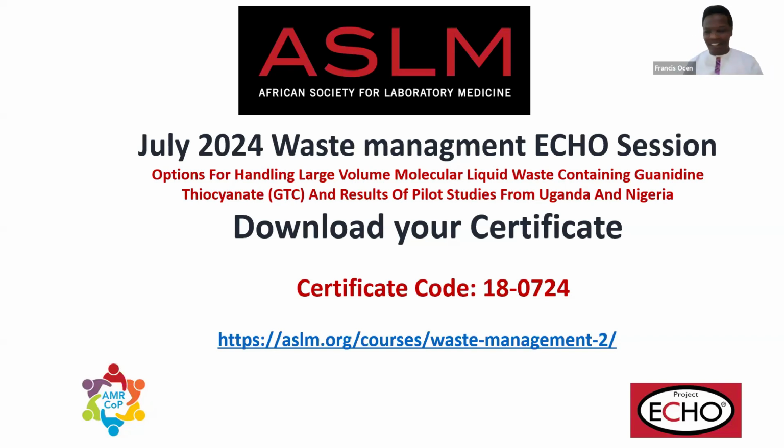Let me get back to Joel a little. Quite a number of questions are coming in and very interesting, but we will deal with all these questions even post the session today. The one that is there is from Ed, and Ed is asking, Joel and team, we have multiple research labs in the country that are also doing viral load testing. Do you have a way of supporting some of these labs or providing them guidance on how to use this very effective method you're using to degrade their GTC, so that their disposal is also as safe as the one that is happening at the centralized viral load and EID testing labs?